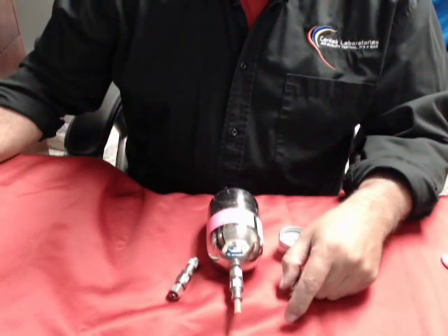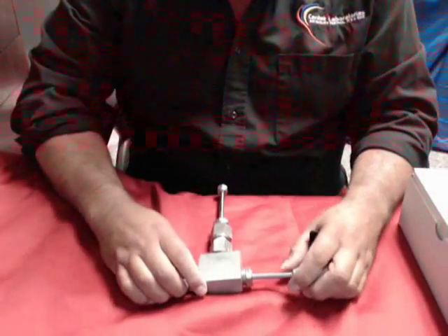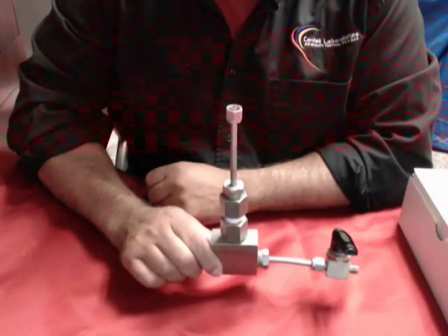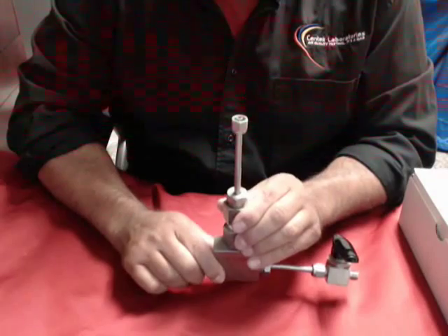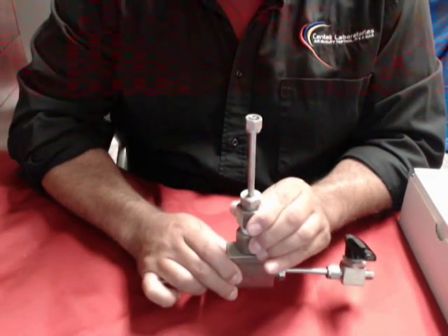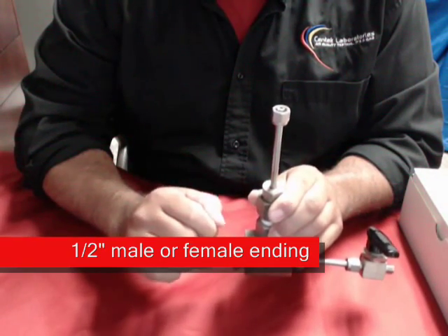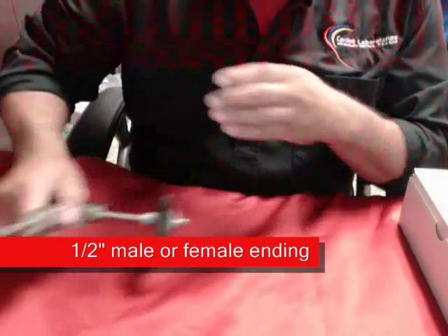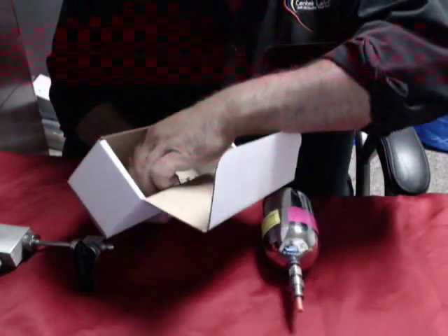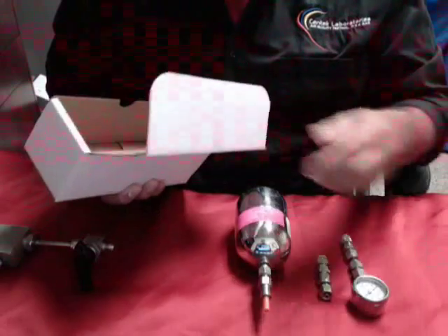Let's get started on taking a sample with the canister. Now that you've determined where you're going to sample from and the ports you're going to use, please make sure that your sampling port is in the upright position. We really want you to get yourself down to either a male or female quarter-inch ending so our equipment will retrofit to yours. When you receive your kit, what you will get inside your box will be a canister, a quick grab regulator, and a gauge to measure your vacuums.